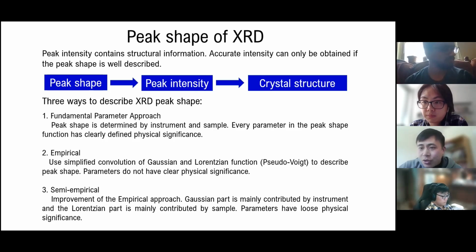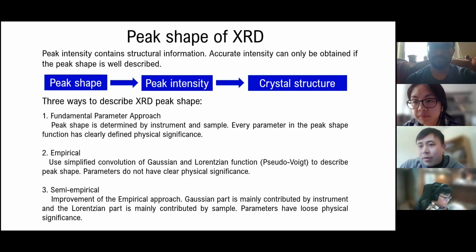A more accurate picture is still scattering, meaning that scattering happens when the scattering vector is also a vector in this reciprocal space. That's the accurate physical definition of when scattering happens, and that's the beginning of understanding much more information about X-ray diffraction, rather than picturing it as some sort of reflection like a mirror reflecting light, which is pretty shallow, I would say.